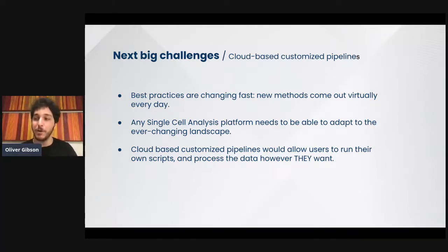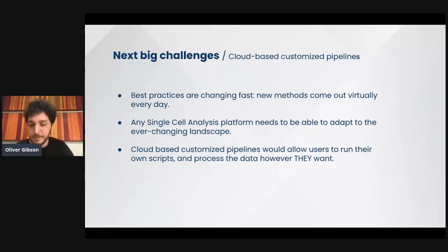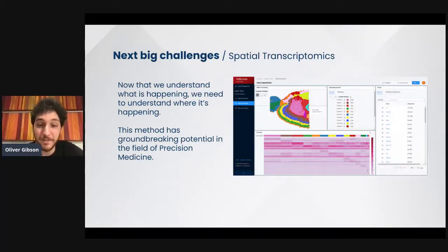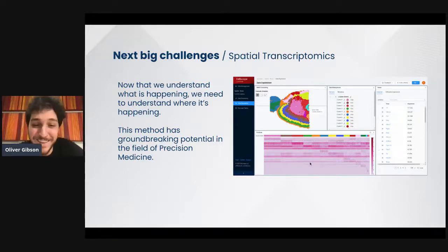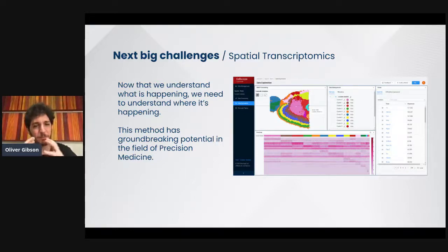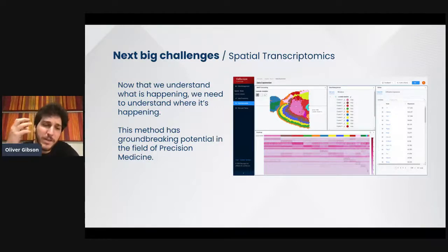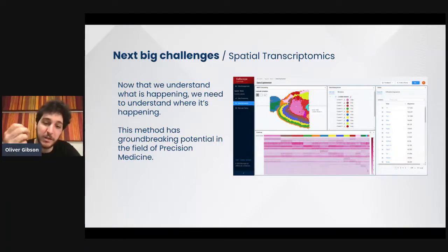The other big thing that is coming is spatial transcriptomics. This is a current picture of Selenix with a spatial transcriptomics dataset. Spatial transcriptomics is based on in-situ sequencing of cells in the tissue. It gives us not only the understanding of what the cells are doing, but where it is happening — the context for each and every cell.